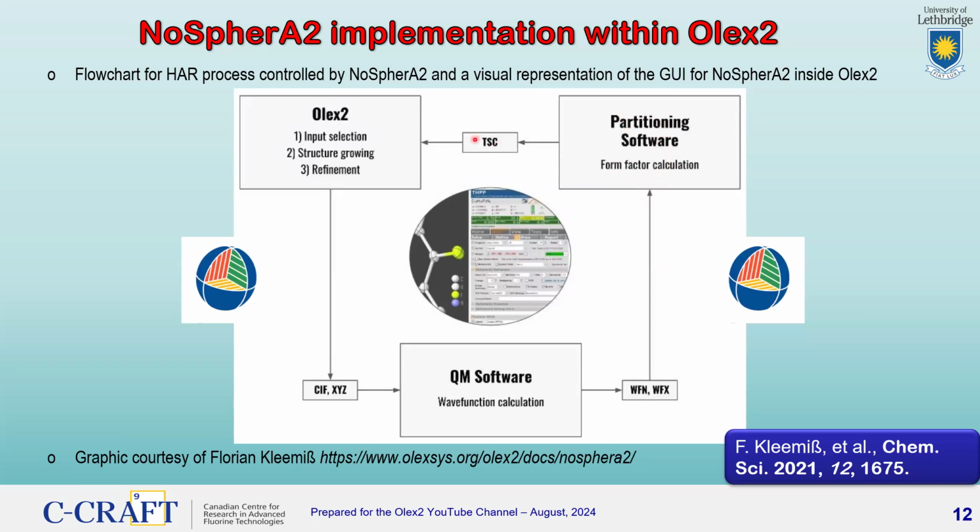That outputs a tabular form of the form factors, in a format that can be read by OLEX2 and will replace the normal input of the independent atom model. And then OLEX2 will run, through OLEX2 Refine, an improved refinement of the structure where we are now incorporating the corrected and much closer to reality form factors for the individual atoms.